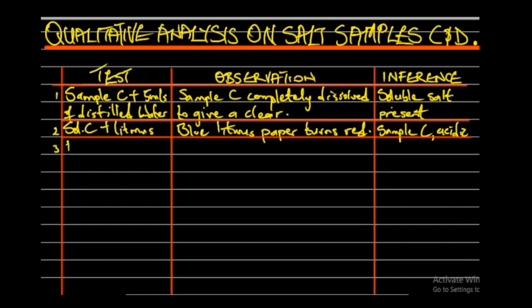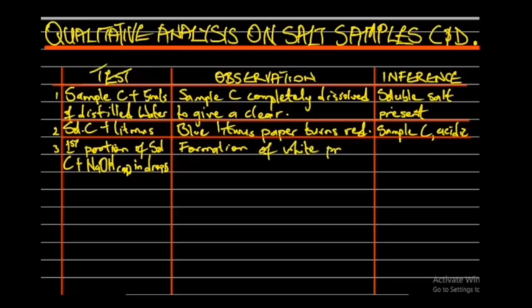To the first portion of solution C we added sodium hydroxide in drops, and we observed the formation of white precipitates.